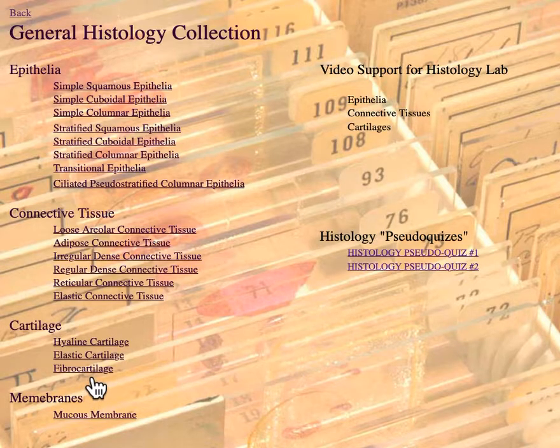Last tissue is fibrocartilage. And if you look here at this image, you can see, when you're dealing with it, how do you know this is not regular dense connective tissue or if it's a cartilage? Well, again, I don't want to be too redundant. I'm always redundant, but I can see a lacunae with a chondrocyte. A lacunae, there's another lacunae. So this is a cartilage.